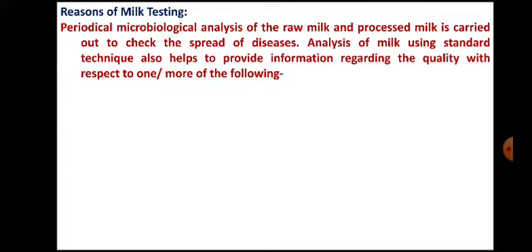These tests are to be carried out on raw milk, that is directly collected from the animal, and processed milk also, to check whether it contains any spoilage causing microorganisms as well as any disease causing microorganisms that may be responsible for zoonotic infection.